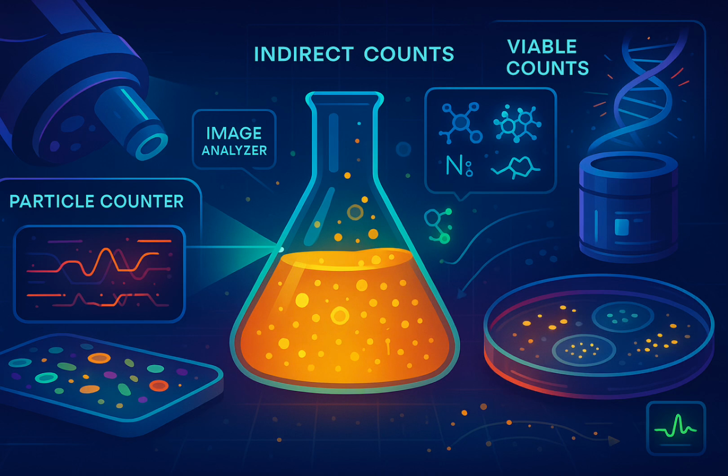Sounds powerful. What are the challenges? Well, it's a precise technique, needs careful handling. The main biological issue is that the amount of ATP per cell isn't constant. It varies hugely between species, with cell size, growth phase, stress levels. So it's a good indicator of total metabolic activity or active biomass, but converting that light reading into an exact cell number is difficult and often unreliable, and the equipment's fairly expensive.